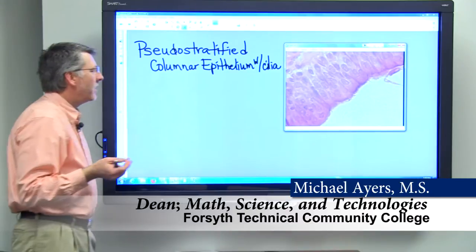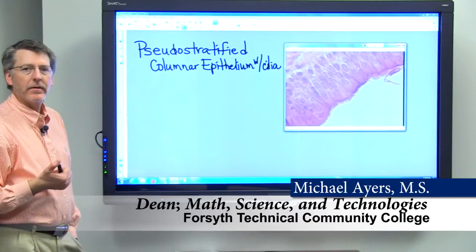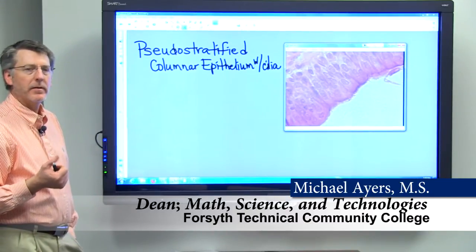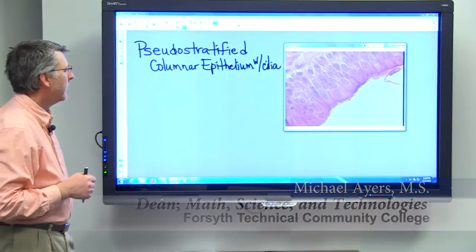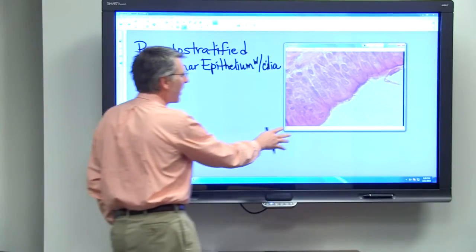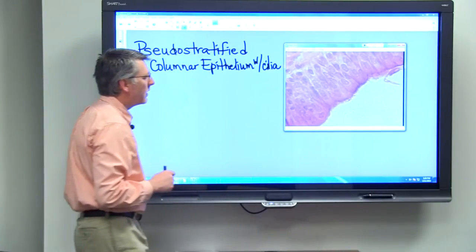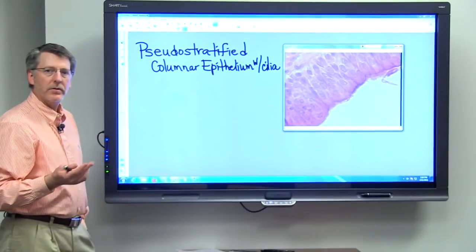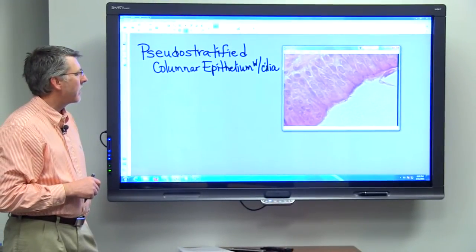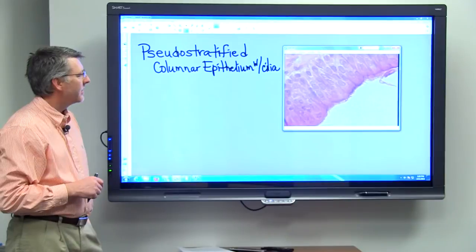Let's think about pseudostratified columnar epithelium with cilia next. I have a micrograph here of a trachea slide that shows the pseudostratified columnar epithelial tissue.